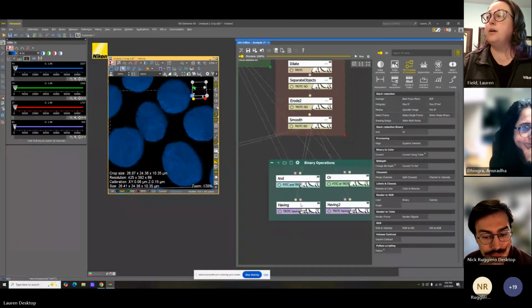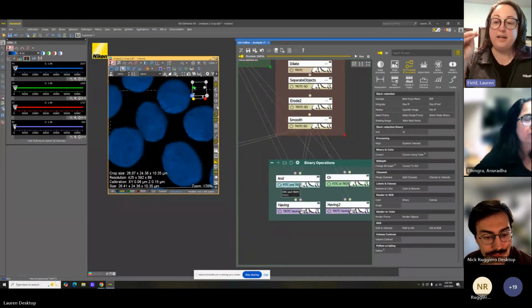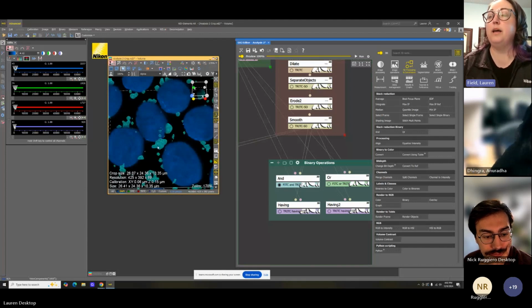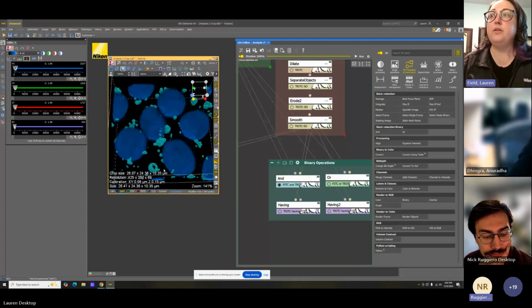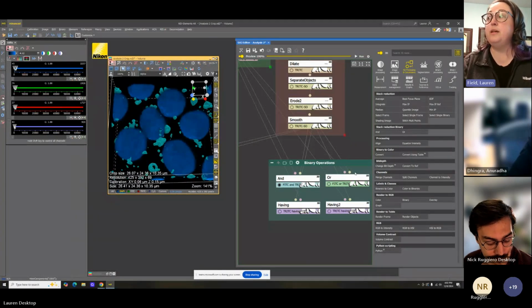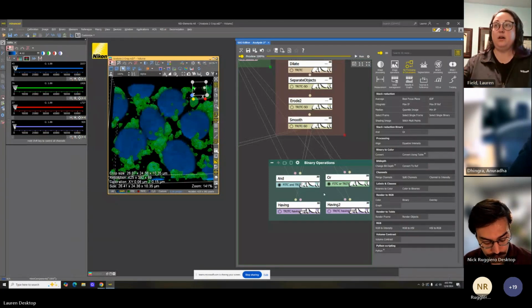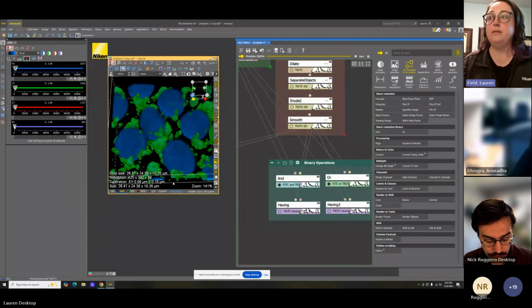So if we wanted to know where pink and yellow both exist in space at the same time, we would do an AND. That would be this kind of light blue binary. So wherever this exists in 3D space, we have both pink and yellow existing together. This should be a comparison to OR. OR is when both are existing and we are combining them into one mighty binary.